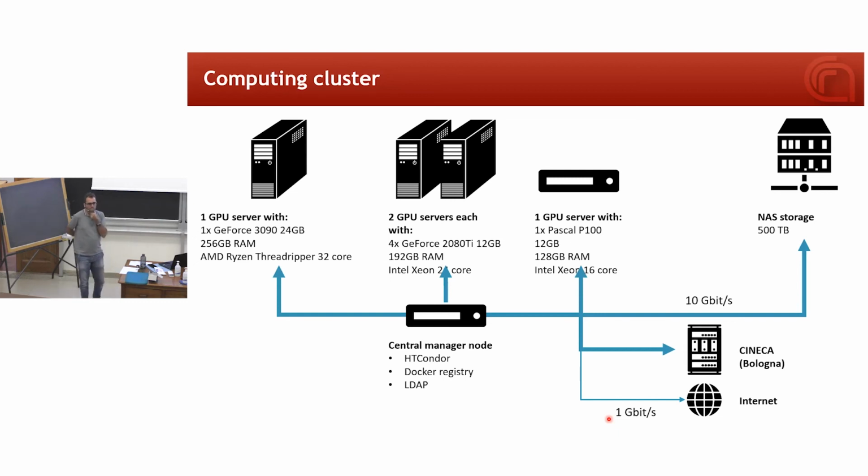No, it's easy, but the problems arise when the data sets are terabytes and terabytes of data, probably. Yeah, that's true, but there's a lot of variability across the sample. Maybe the threshold would need to change across the sample. You have fibers and other structures that you don't care about. Maybe that's where the predictive power of the neural network comes in.